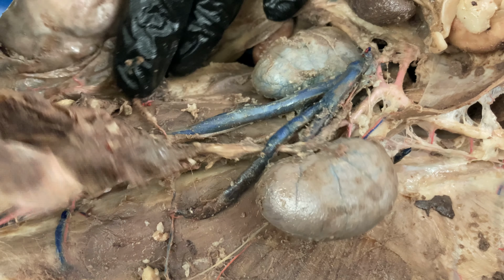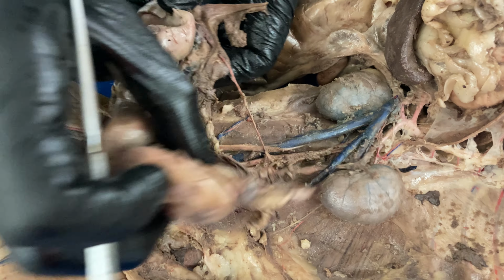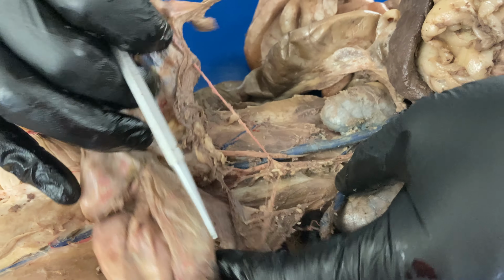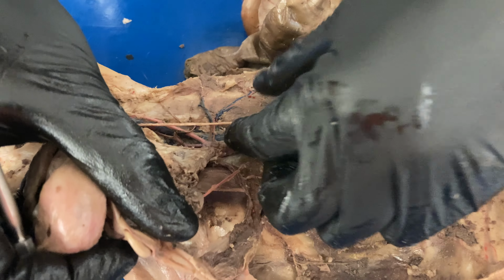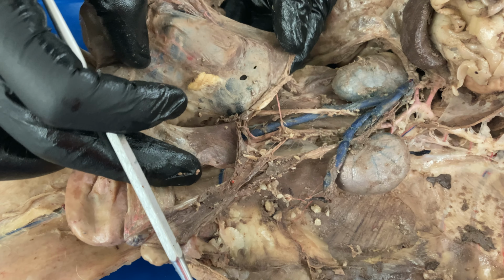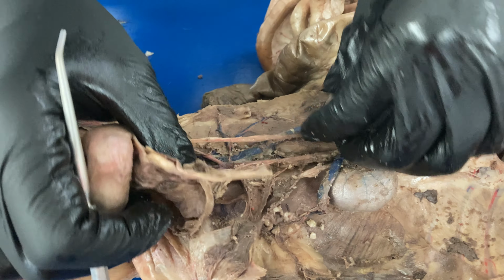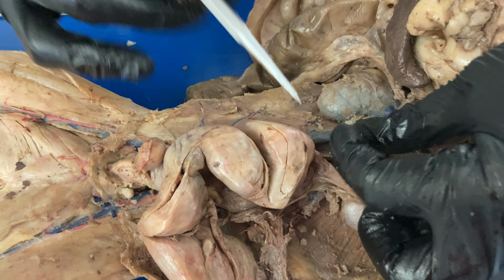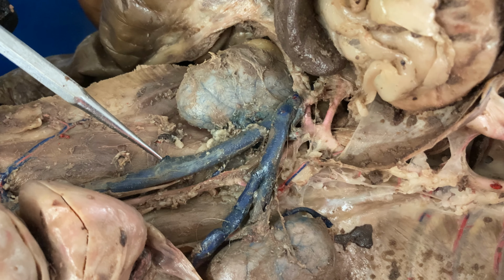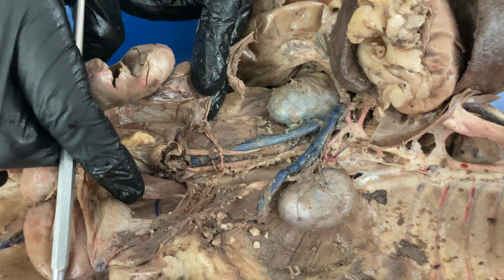The right gonadal, which I think is it still intact? It is not intact. Okay, so it would come to the ovary, and it actually has been cut. I think it's somewhere in here, but it would be around the same place. And let me see if I can find the branch. Oh, it would be this one right here. You see that little cut right there? That would be your gonadal, and it would be coming off to the right where the ovary would be. So the ovary would be over here.